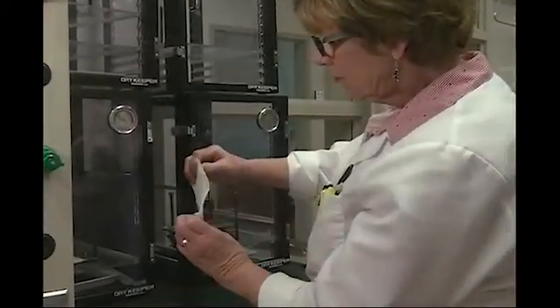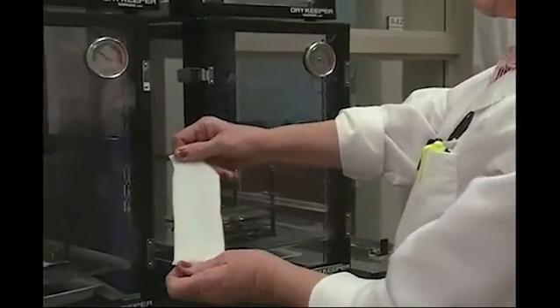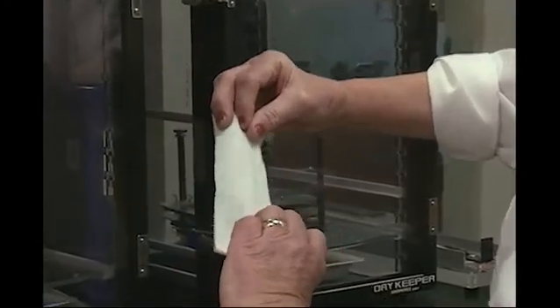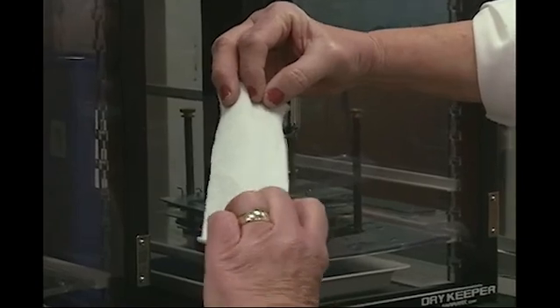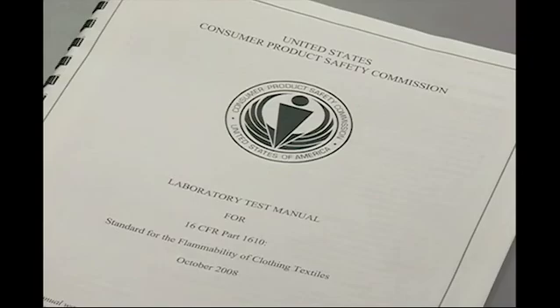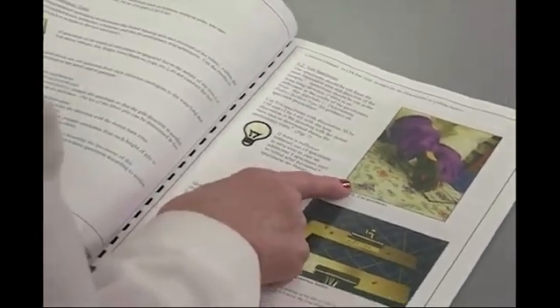It is illegal to sell Class III clothing in the U.S. Although it is not illegal to sell clothing classified as Class II, textile companies usually do not want to assume the risk of possible injuries, so only Class I items are sold. The CPSC has developed a laboratory manual that includes flow charts to illustrate the prescribed sequence of testing for plain and raised surface fabrics.